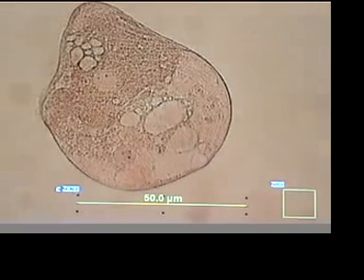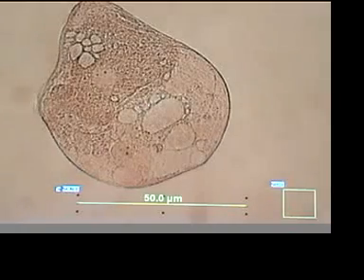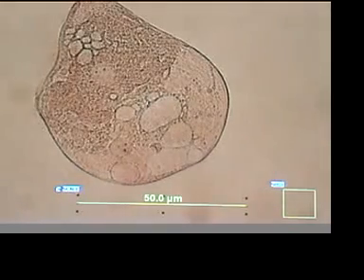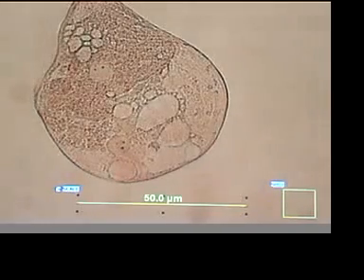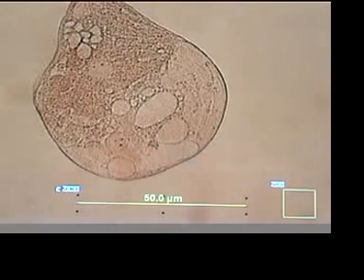Now, one of the concerns you have is, were the organisms simply squished by the cover slip, or were they dehydrated? So I will make another slip and make sure, but there are other small organisms swimming around. Let's see if I can show you a few.